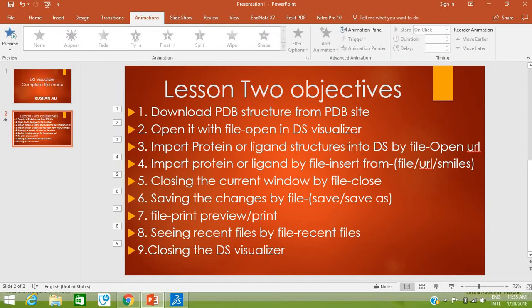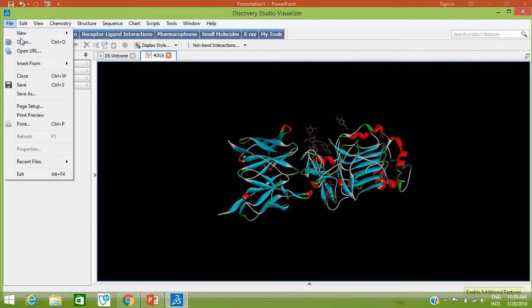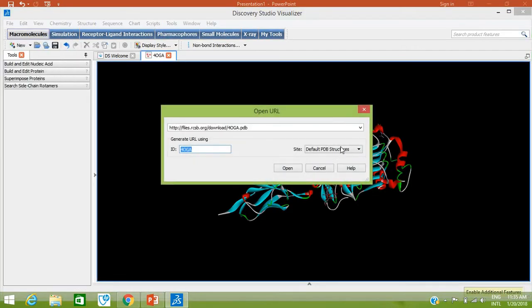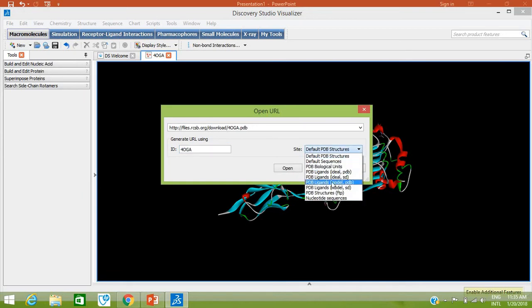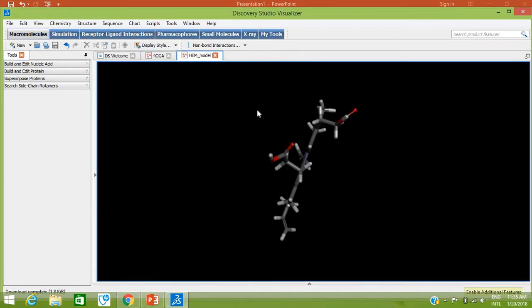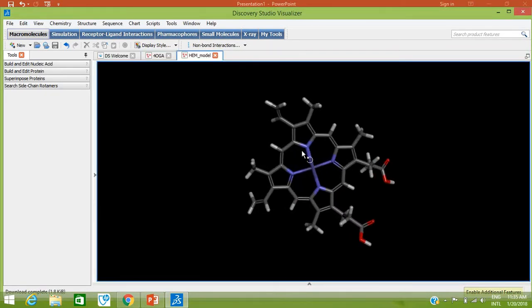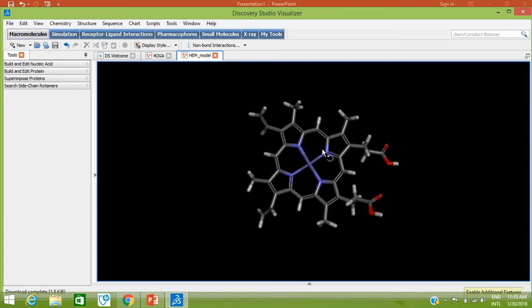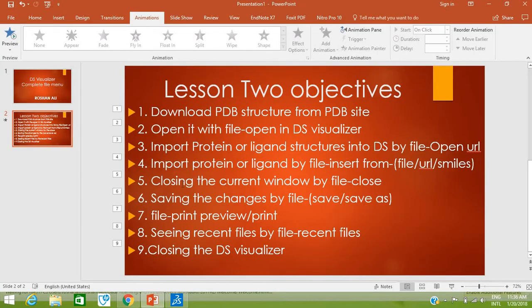Now let's import a ligand structure. Go to Open URL, select PDB Ligands model, and type any ligand name — for example, HEM (heme). Click Open. Your heme ligand structure has been imported from the PDB database. This is the heme structure.